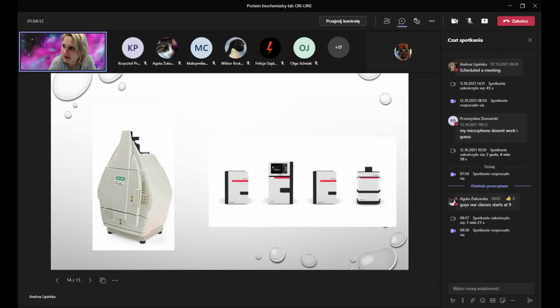Okay, and the conditions of the transfer, of course, we follow the instructions of the producer, but sometimes it just has to be established experimentally. With semi-dry blotting, the problem is that when we open the sandwich, like we open the machine, the blotter, sometimes our sandwich separates and it's impossible to put it back together, for example, to prolong the blotting. So that's the only problem.